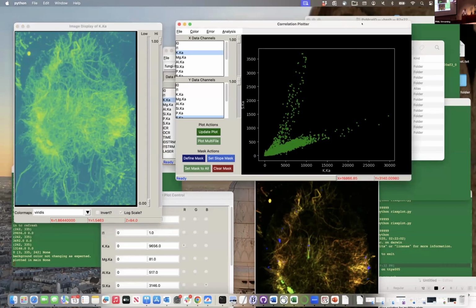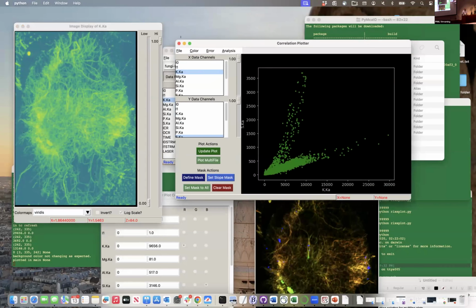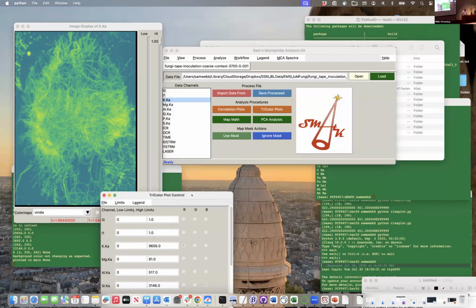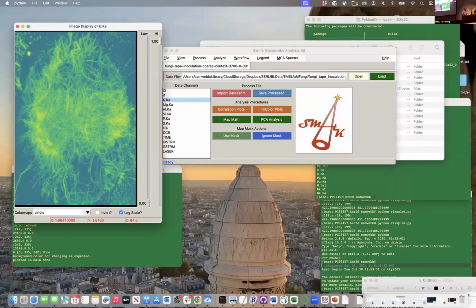Okay, so that's been exciting and fun. Those are the basic features of what we can do with the tool, just for visualization and quick viewing. But now we want to put things together. That's the whole point of a lot of this, right?